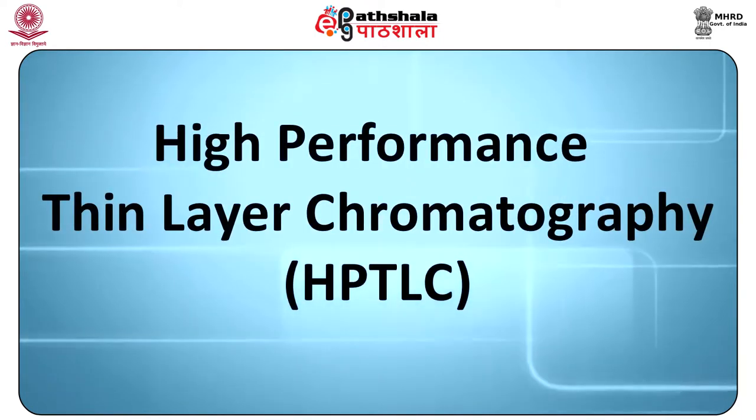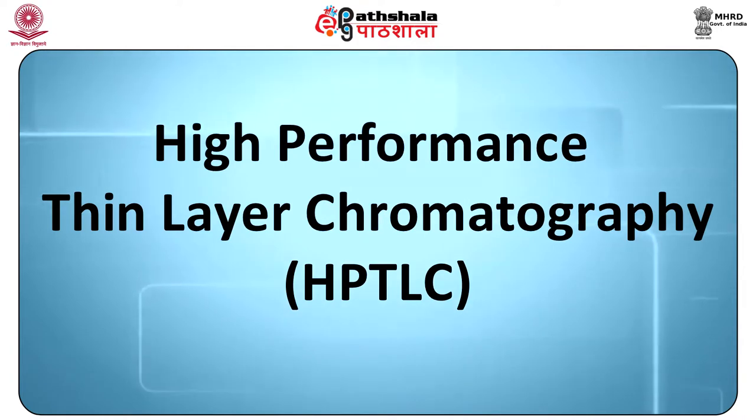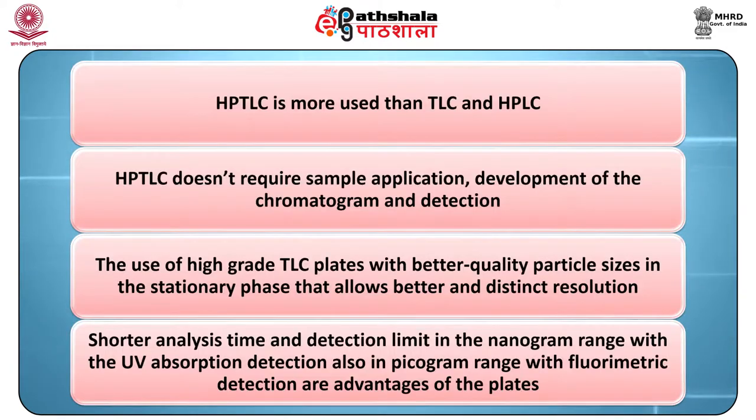High performance thin layer chromatography, also termed HPTLC. HPTLC is an organized and automatic form of thin layer chromatography with improved and unconventional separation and detection parameters. It is also known as high pressure thin layer chromatography, planar chromatography or flat bed chromatography. Nowadays, HPTLC is more used than TLC and HPLC because HPTLC does not require manual sample application, development of the chromatogram and detection and so on.